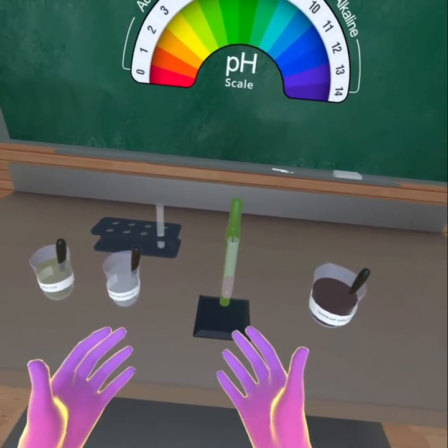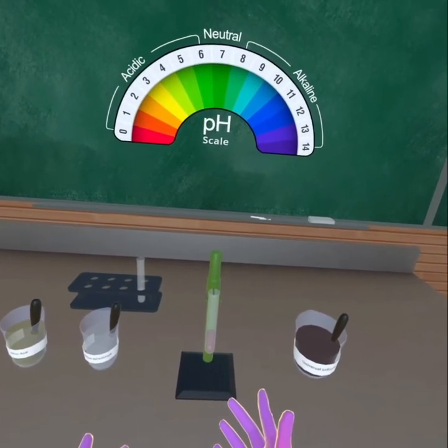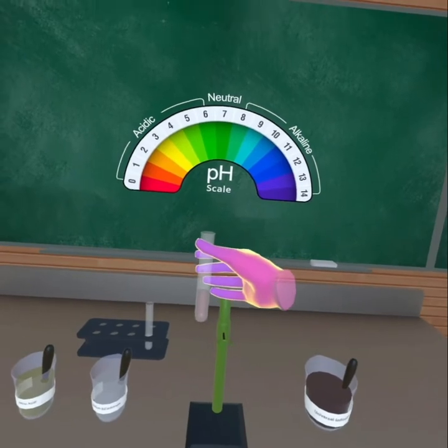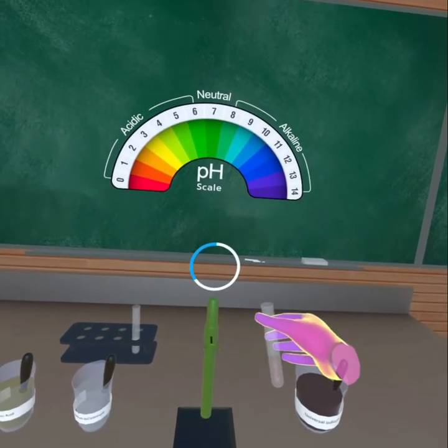Grab the test tube out of the single test tube stand. I am highlighting the same for you. Shake the test tube gently, so that sodium bicarbonate and universal indicator solution get mixed properly.